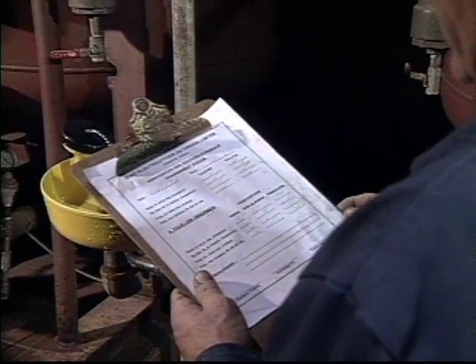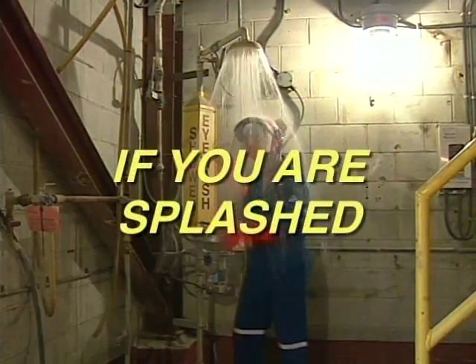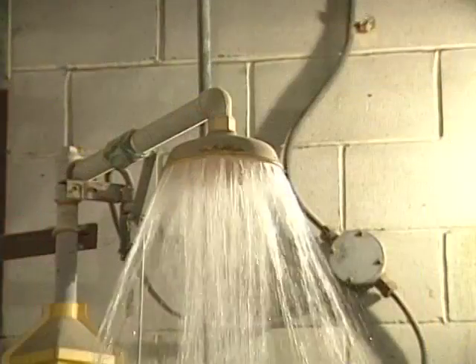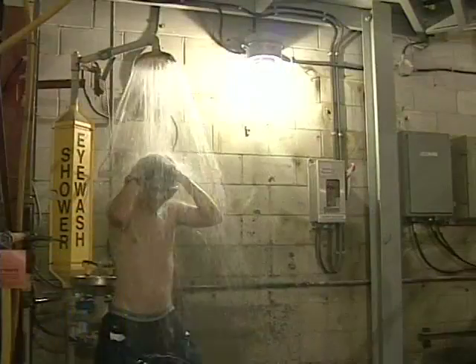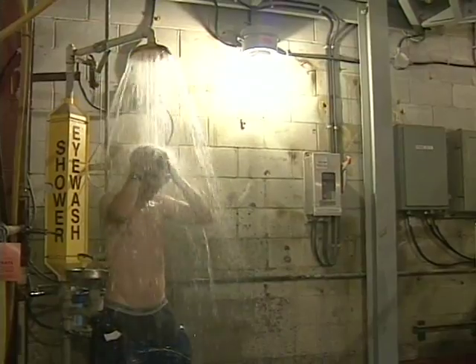Every safety step properly followed reduces the chance and effect of even minor accidents. But if you are splashed, run to the shower, removing clothes while washing, and most importantly, stay in the shower for at least 15 minutes to dilute the corrosive effects of the acid. Leave goggles on while in the shower to help prevent residual acid from entering the eyes.